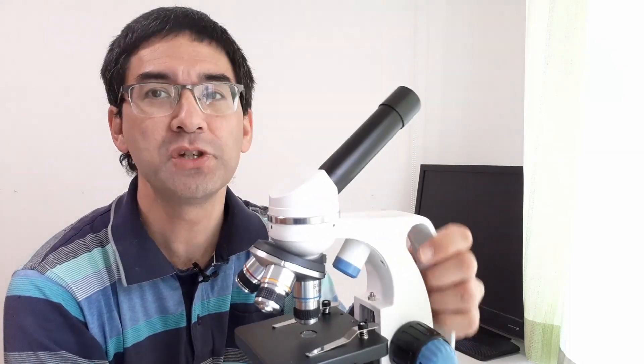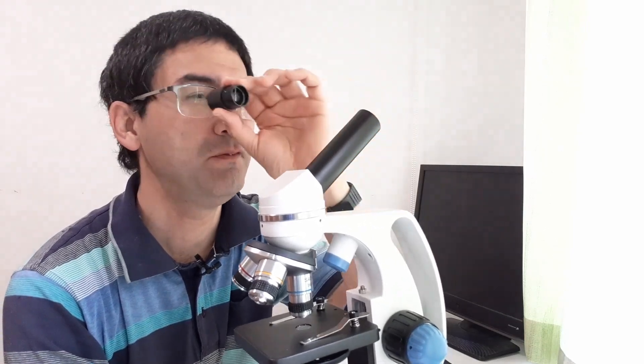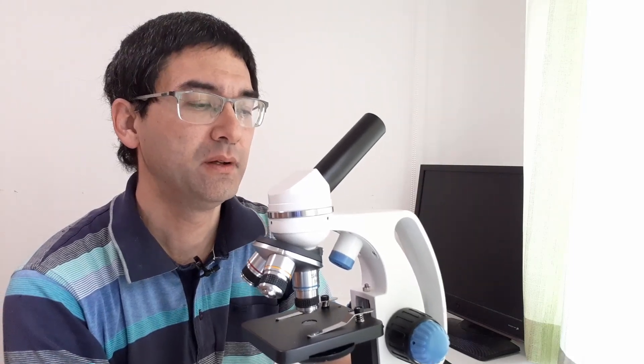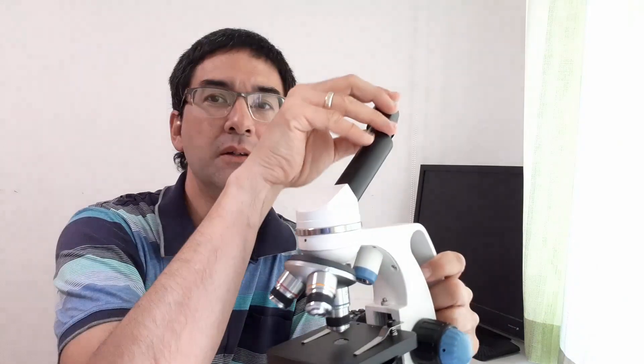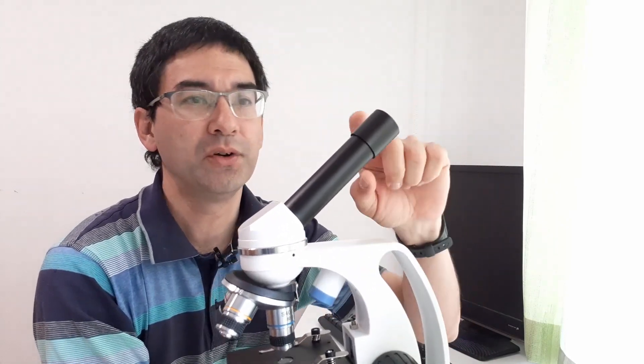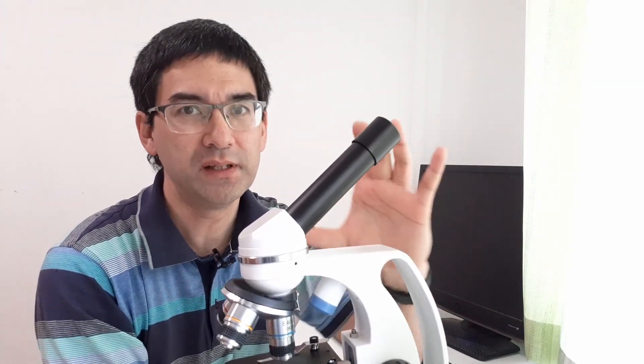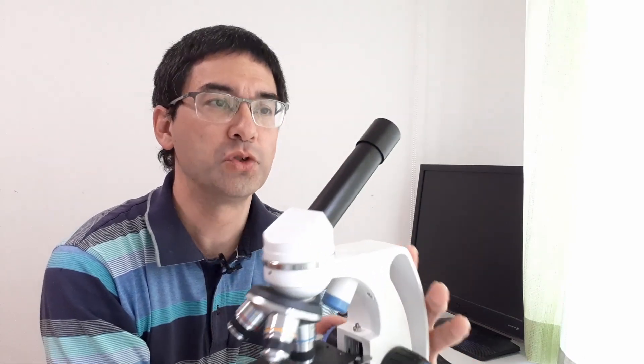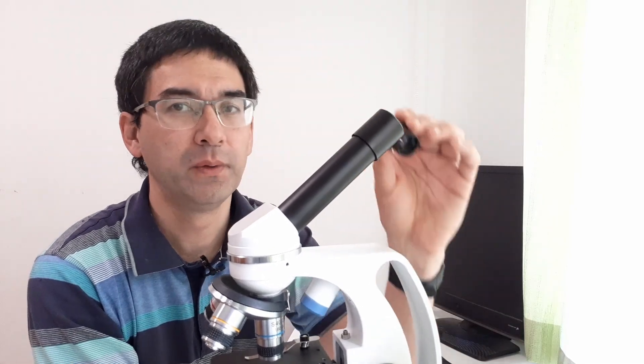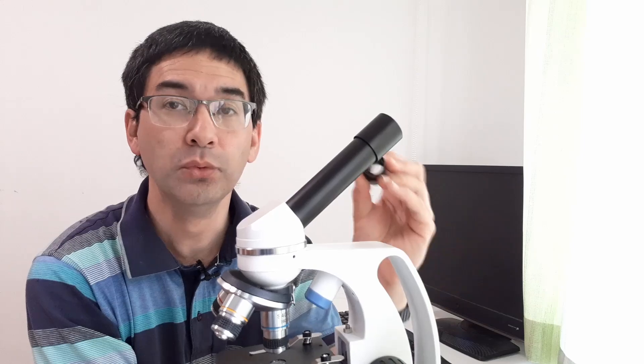I do have a suggestion. If you want to upgrade it, those microscopes are not really designed to be upgraded so much, but there is one option. If I were to invest anything more, I would probably exchange this eyepiece here which has a field number of 16 with another eyepiece, ten times eyepiece, which is slightly larger. This one has a field number of 18. Why I would do that, because you're seeing much more. So the circle that you see is actually wider with those. It's of course also more expensive, but the magnification is the same. The amount that you actually see, the circle, is larger. In that sense it's a little bit more convenient to observe.